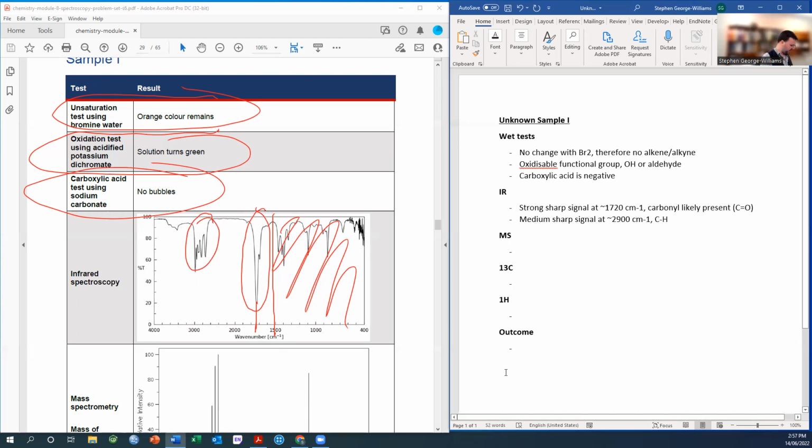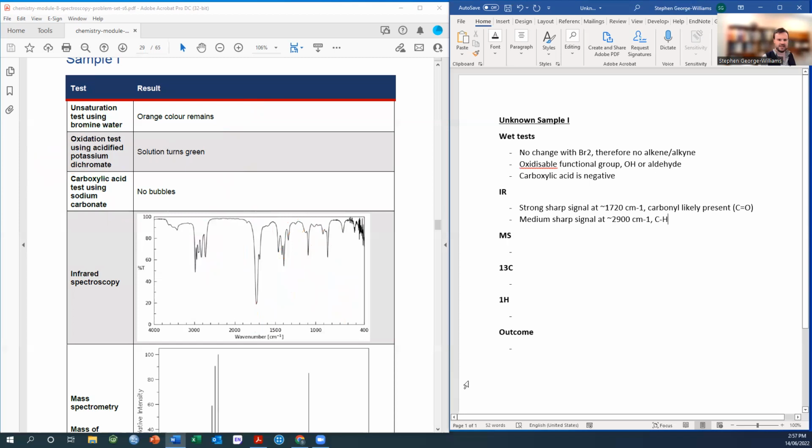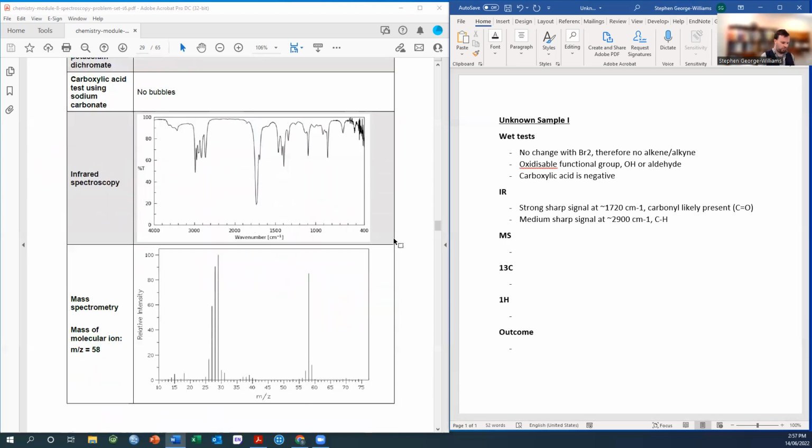Coming down to my mass spectrum, what can we pull out? Well, I have a molecular ion of 58, which I can confirm as that signal here. I can see that in that region, there's no 1-to-1 peak that's 2 away. I don't get that kind of arrangement, nor do I have a signal that's, say, about a third of the height, 2 mass units away. Importantly, what I'm saying there is that I don't see any halides. I'm not seeing chlorine or bromine present in my mass spectrum.